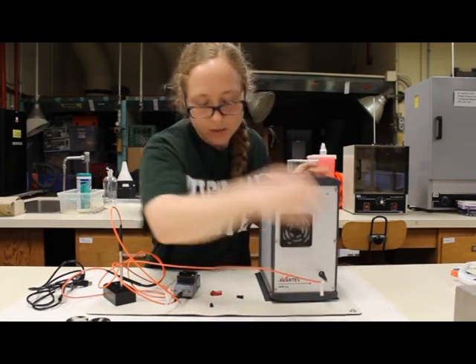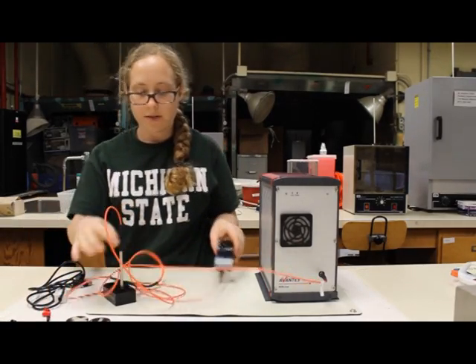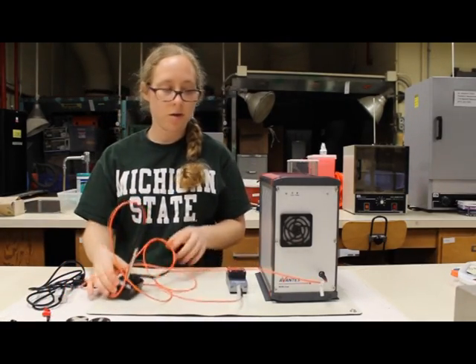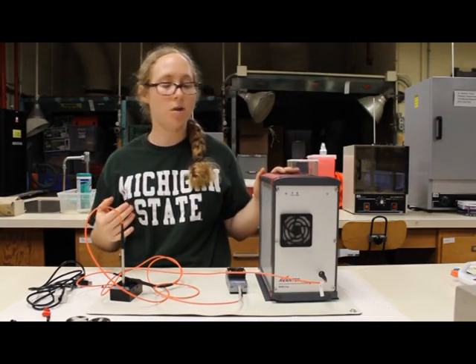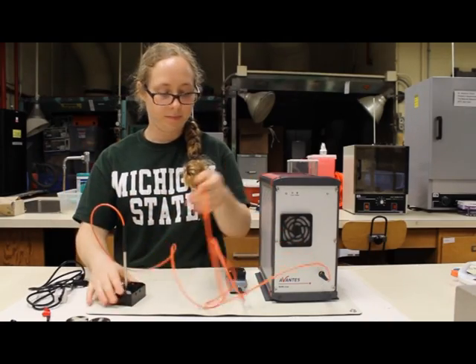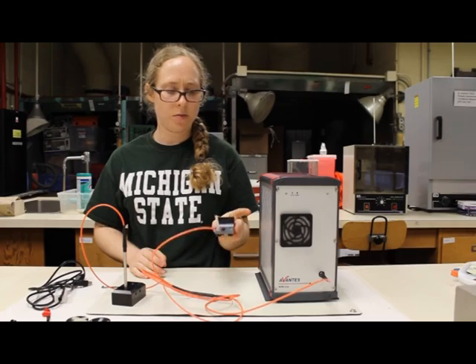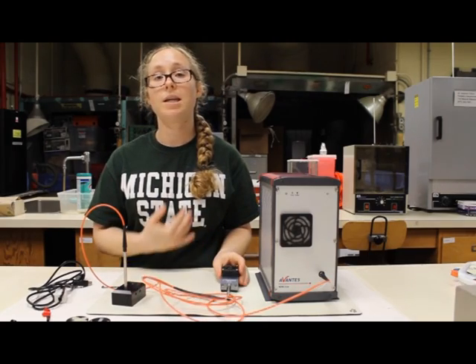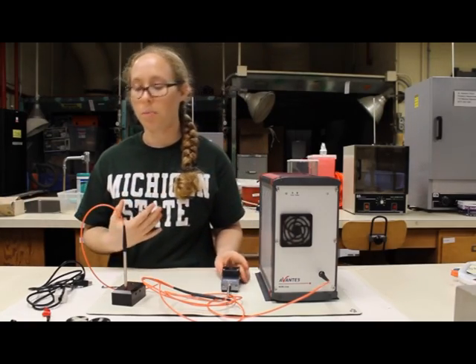Once those are connected, all you have to do is connect your light source and the spectrometer independently to a power source, and connect your spectrometer to your computer. It should be mentioned that most light sources, including this one, need to warm up for at least 15 minutes before they can produce a steady output.